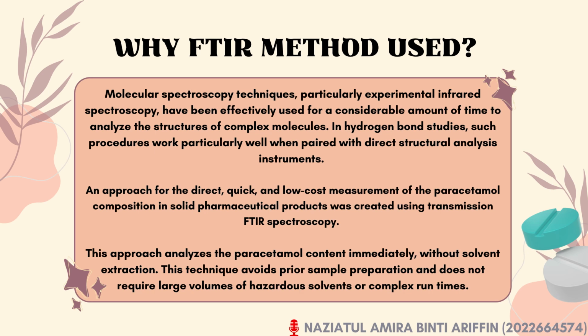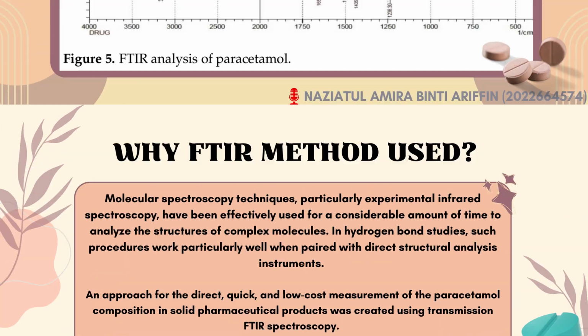An approach for the direct, quick, and low-cost measurement of the paracetamol composition in solid pharmaceutical products was created using transmission FTIR spectroscopy. This approach analyzed the paracetamol content immediately without solvent extraction. This technique avoids sample preparation and does not require large volumes of hazardous solvents or complex runtimes.